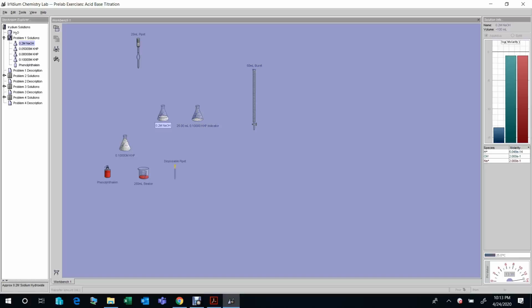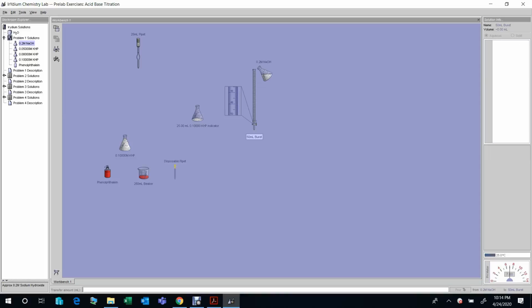And then you see here we can just add, for example, 40 milliliter solution. We can just add around 40, because if we add 50, it may overflow. If we add 40, it's very unlikely that we overflow the burette. Okay, we add 40. So 40 is more than what? It's more than the 12.5 that is needed to complete the reaction, right?